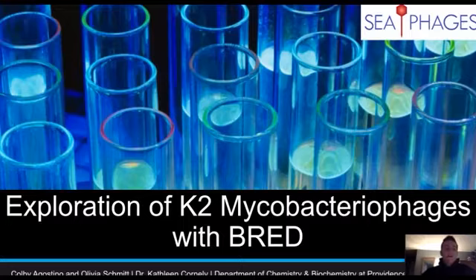Our project is called the exploration of K2 mycobacteriophages with BRED. BRED stands for bacteriophage recombineering with electroporated DNA, and we'll get into what that means in a little bit here.